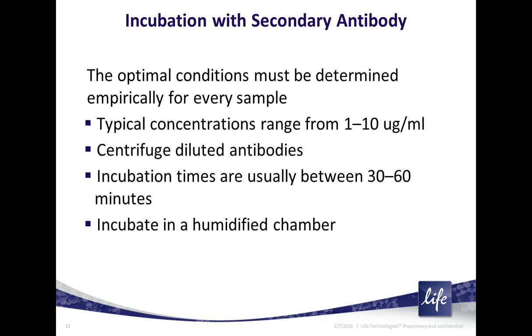And you'll dilute your antibody into something like 6% BSA in PBS. It's very typical. And incubate for 30 to 60 minutes for cultured cells. Again, with tissue, you often go longer, sometimes a couple hours or even longer to get good penetrance. And I recommend for both primary and secondary antibody labeling steps and counterstains too, to do the incubation in a humidified chamber of some sort so that you don't get evaporation effects concentrating your dye more than you want it to be.